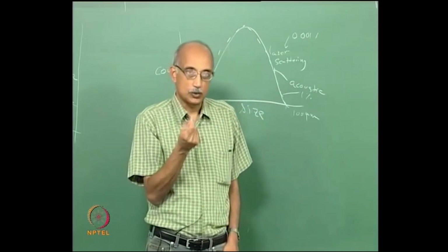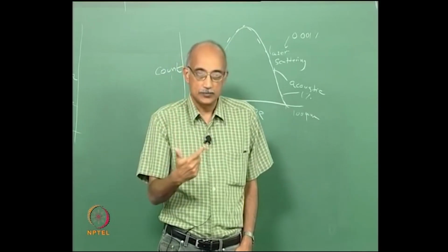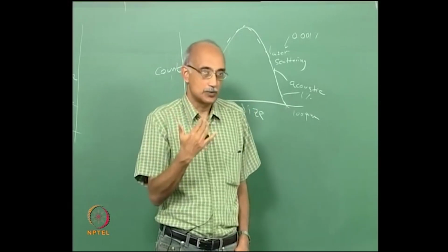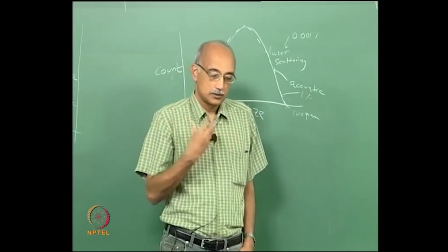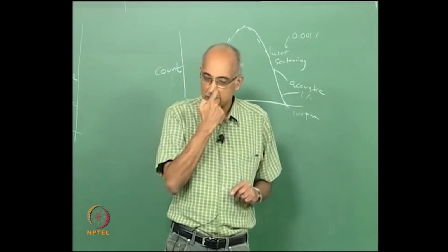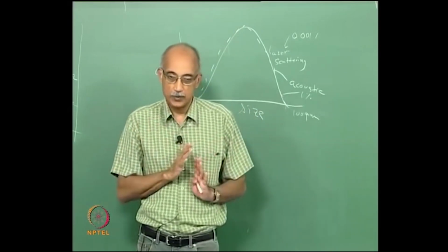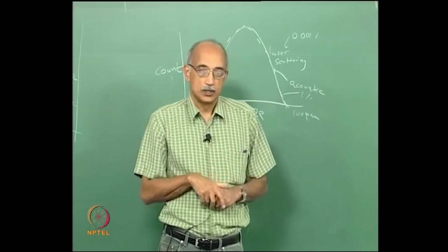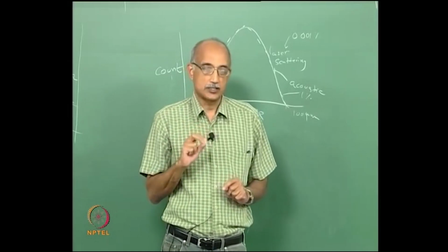The crystal or the core is the interior, but there is also what is known as a subsurface region and a surface region, which act as the interface between the crystalline structure of the particle and its surroundings. And so these three sizes are important to characterize when we are trying to determine the shape, well, in particular the size of nanoparticles.